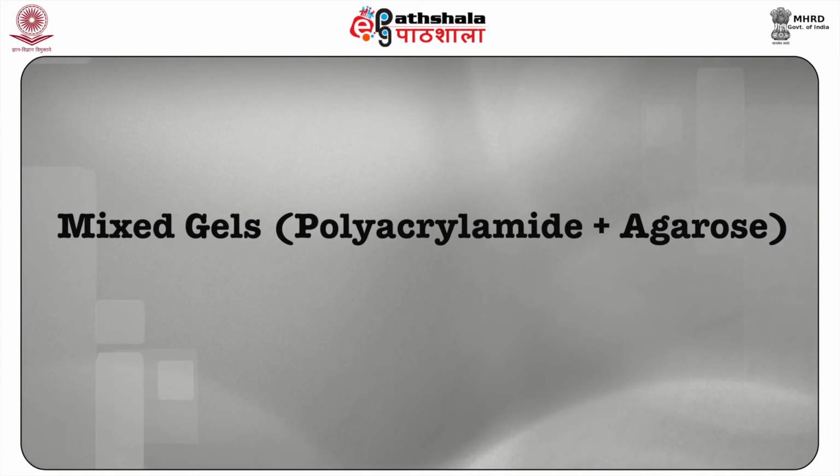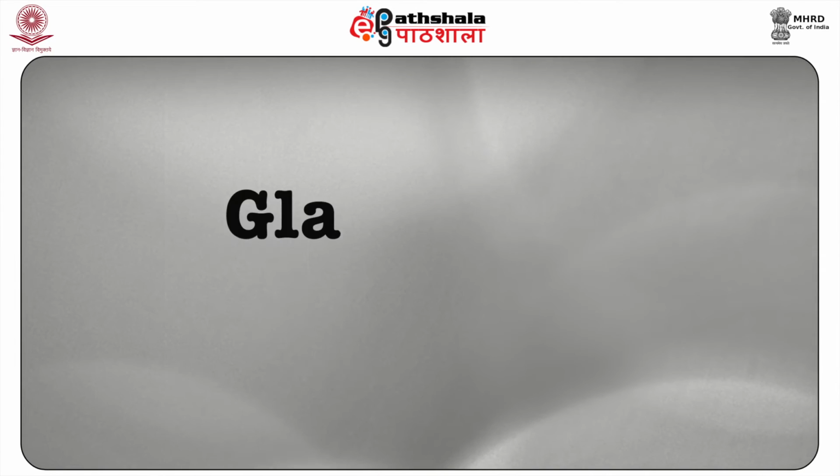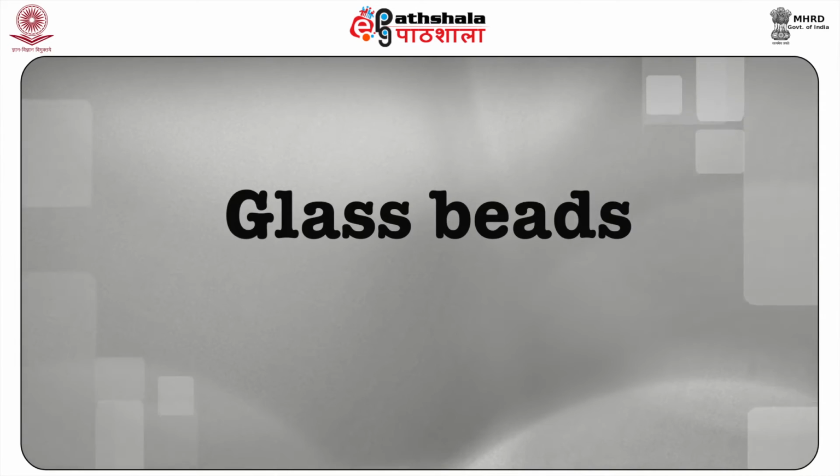Problem with agarose gel, students, is that they soften at a temperature above 30 degrees Celsius. So that is a very narrow range of temperature to work with. Now, the next which we'll be talking about is a mixed gel containing polyacrylamide as well as agarose. Mixed gels of polyacrylamide and agarose are available, in which the polyacrylamide provides a three-dimensional structure which supports the interstitial agarose gels. Glass beads. Now let us discuss about these.